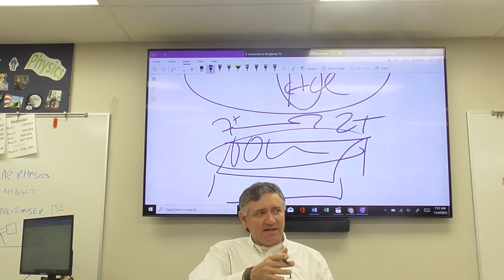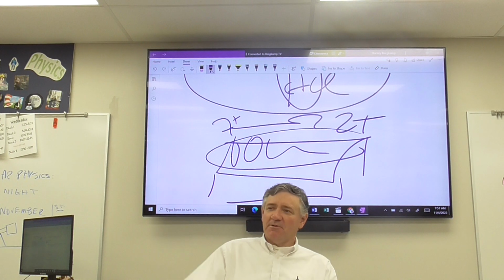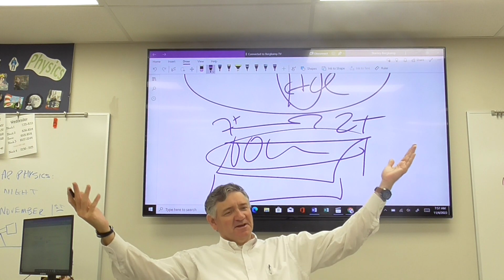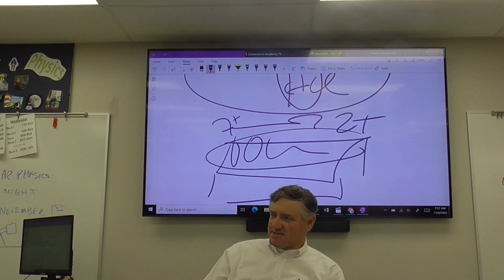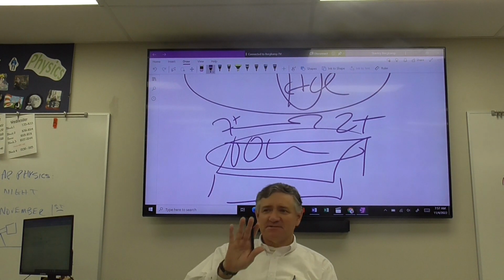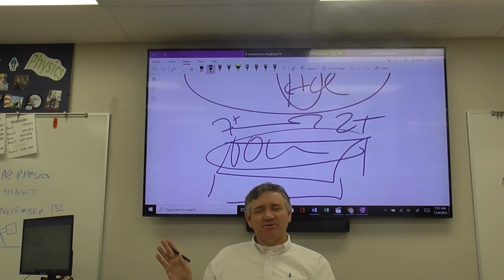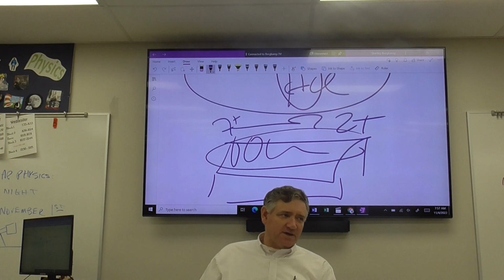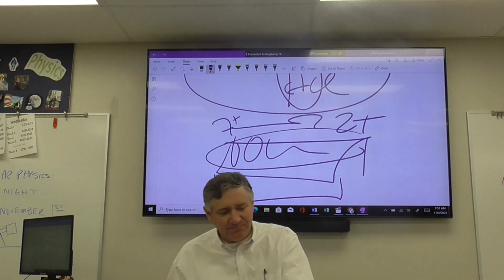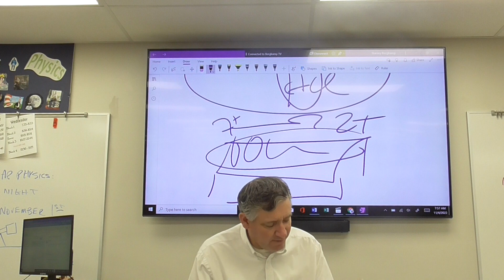That's the idea. So when you get done, you can call me over and say, look, here's the different oxidation states of manganese. Sometimes this works beautifully, other times 1 or 2 drops just wrecks this whole thing. But what you're going to see, and this is the most important, okay? This is the most important.